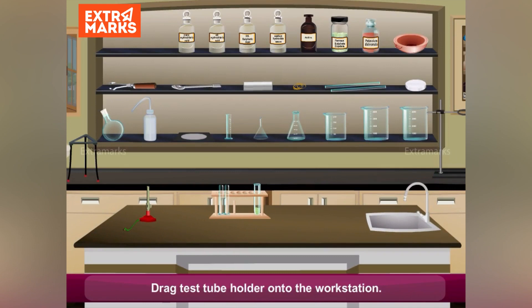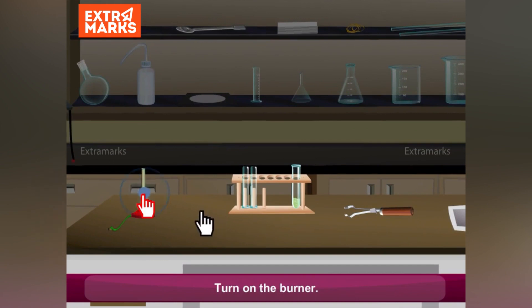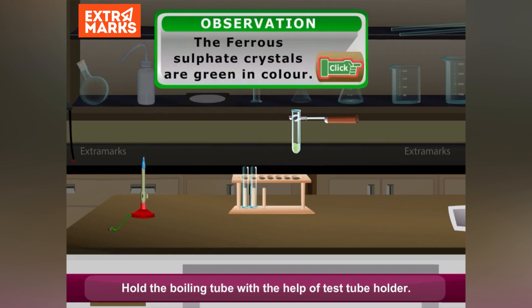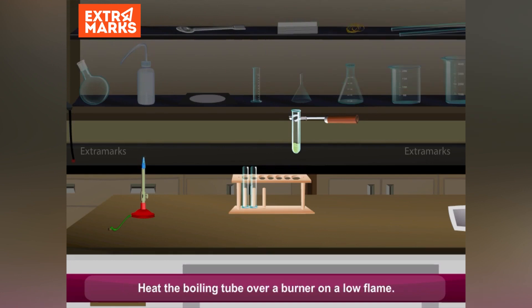Drag the test tube holder onto the workstation. Turn on the burner. Hold the boiling tube with the help of the test tube holder. Heat the boiling tube over the burner on a low flame.